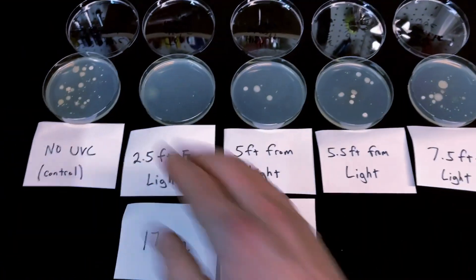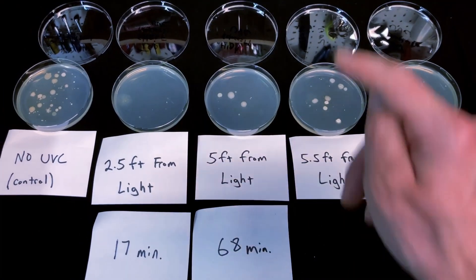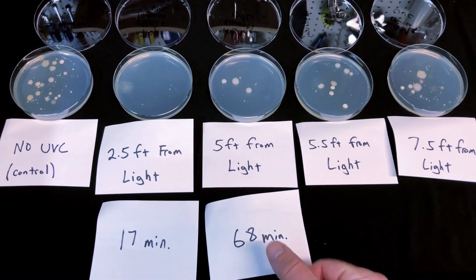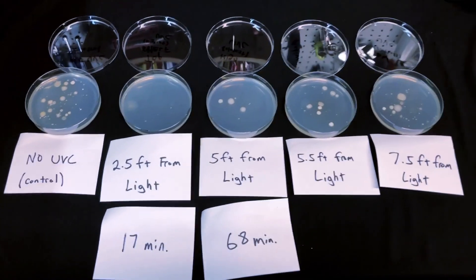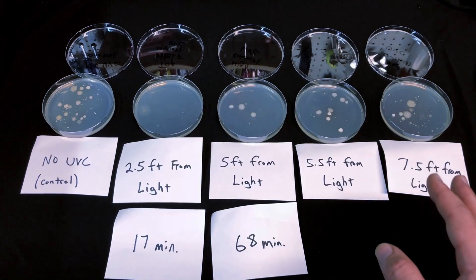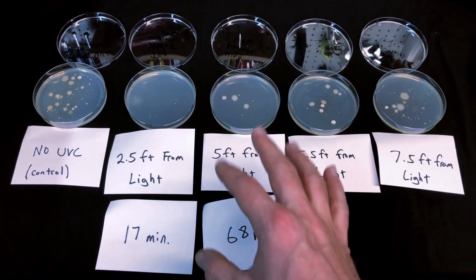Looking at all the results, it's basically exactly what you'd expect — a progressive increase in bacterial colonies as distance increases, driven by time and proximity. The dish on the floor would have needed well over two hours to match the closest result. This aligns perfectly with the inverse square law I discuss in the context of artificial lighting for growing plants indoors — the only difference here is we want the light to kill things rather than make them grow.